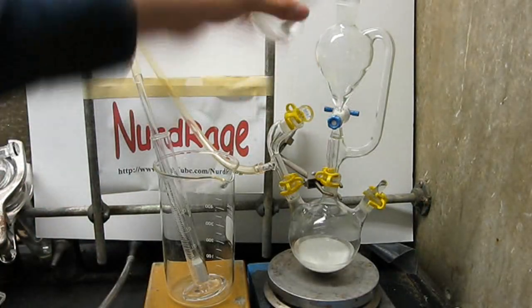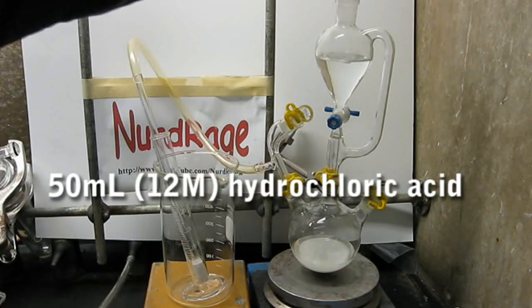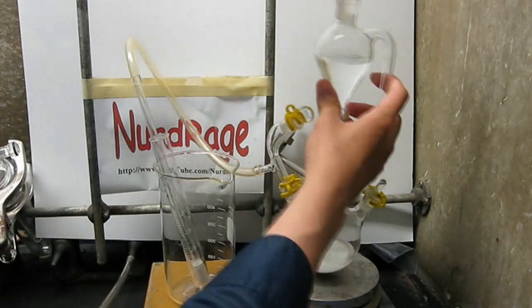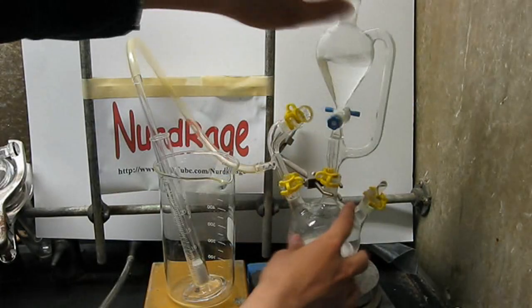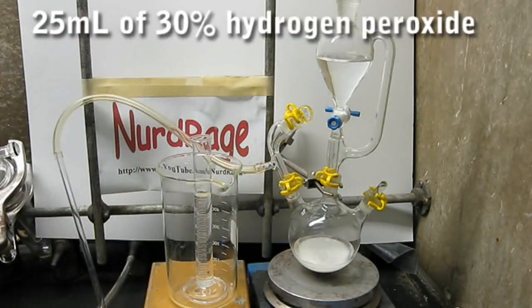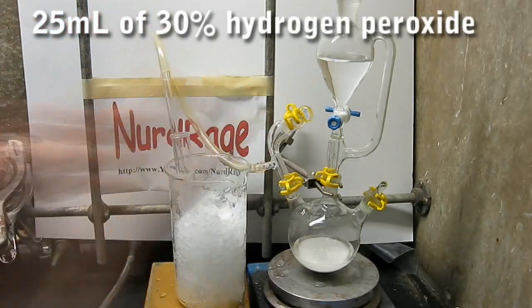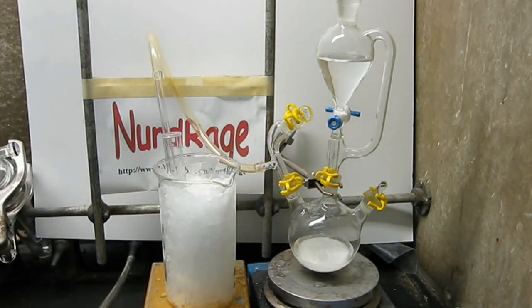Now fill the funnel with 50 milliliters of concentrated 12 molar hydrochloric acid. Be sure to stopper off the top of the funnel so the gases don't leak out. Now fill your graduated cylinder with 25 milliliters of 30% hydrogen peroxide and fill the beaker with ice to form an ice bath around the peroxide.